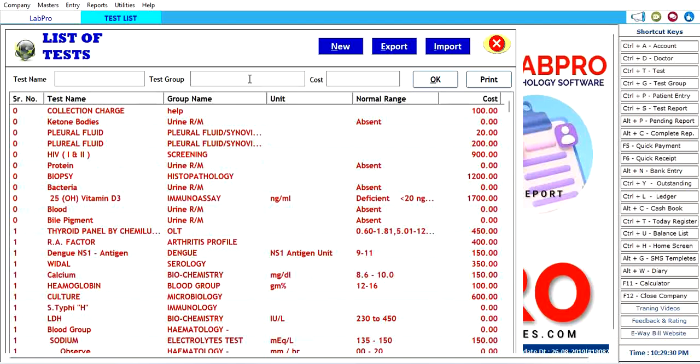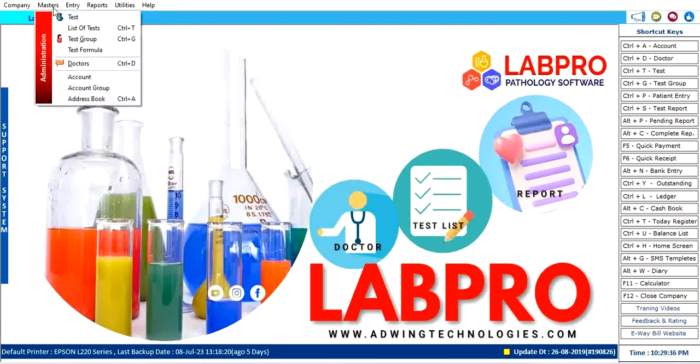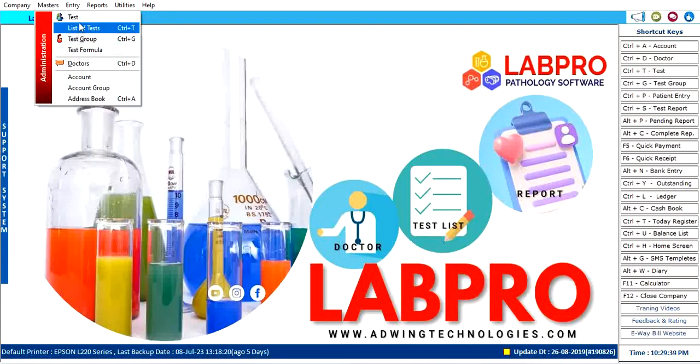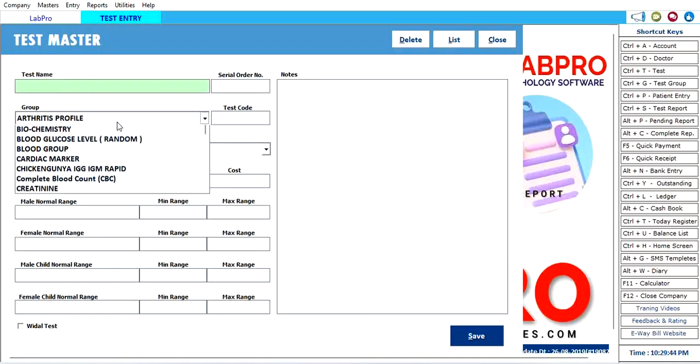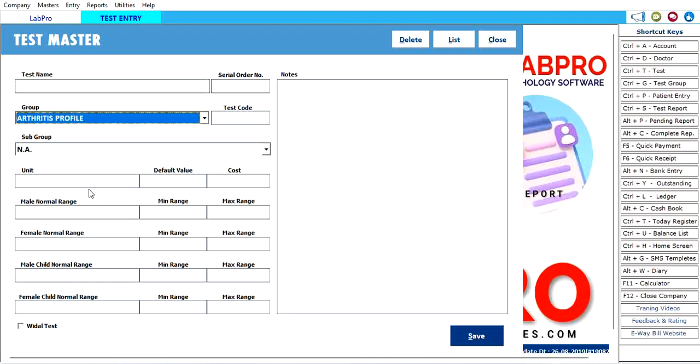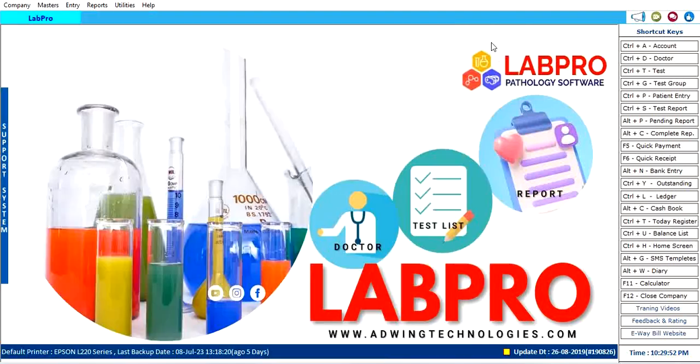If you find any test, you can search it here. You will get the updated test. You can also export and import from this list of items. Apart from that, if you want to change any test, you can just edit here. Write the name of test, choose the group, and manage the normal range. Just put it here and update it.